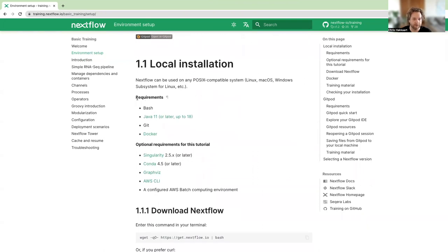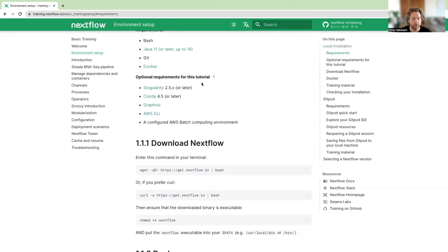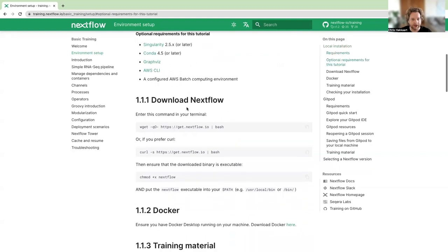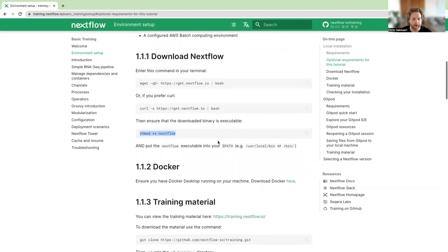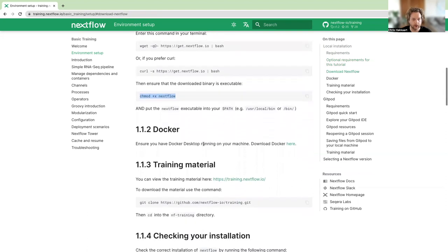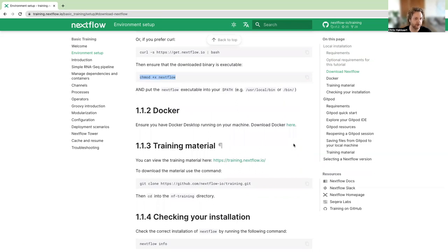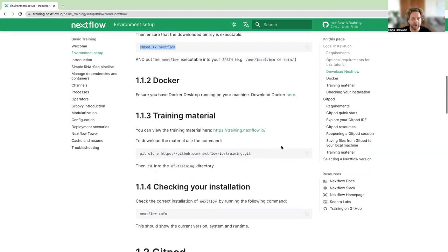Just beneath the requirements, we have instructions for how to download Nextflow using wget or curl, and then make it executable. You'll also need to install and register for Docker by following the link provided. To get the training material, you'll need to clone it from the GitHub repository, which will download all the scripts and data used in this training.